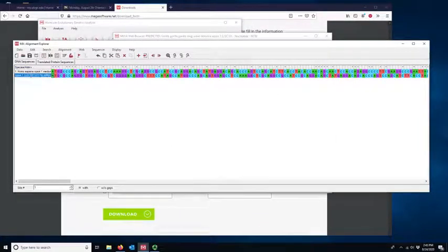Now, if it says predicted, that simply means that they haven't verified what gene it is using methods other than the DNA sequence. But predicted genes are just as good as ones that don't say predicted. Okay, but just so I can see the name of the species first, I'm going to change that. I could have done that originally from the earlier portion also. Okay, gorilla, gorilla, long wavelength.